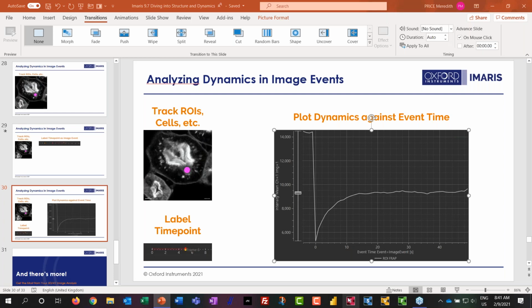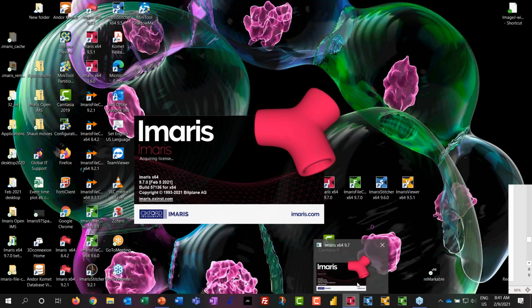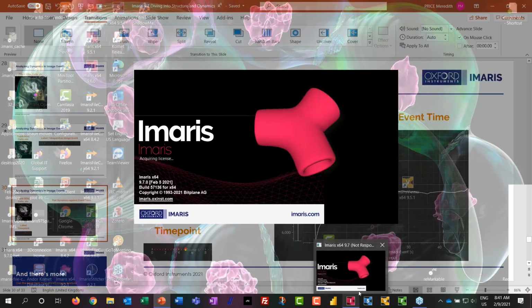Oop. I have the beta running, so that's what happened right there. Sorry for the momentary hiccup.